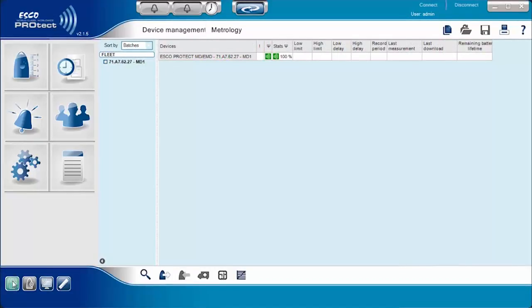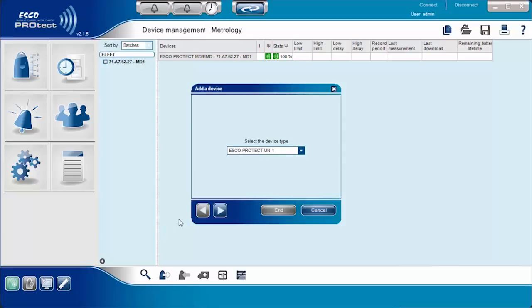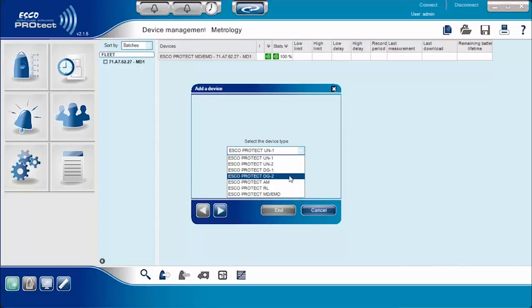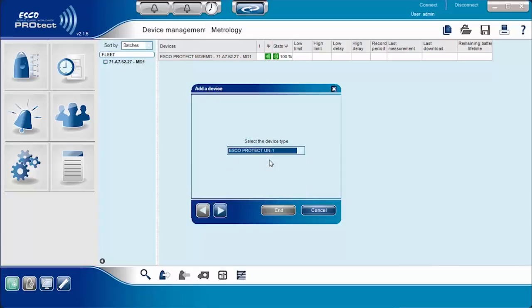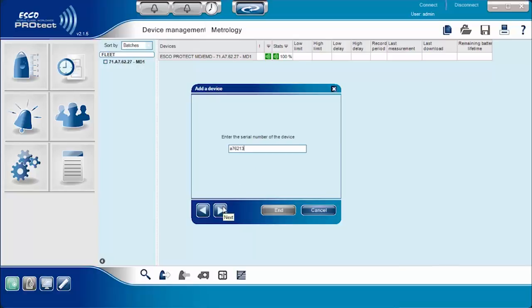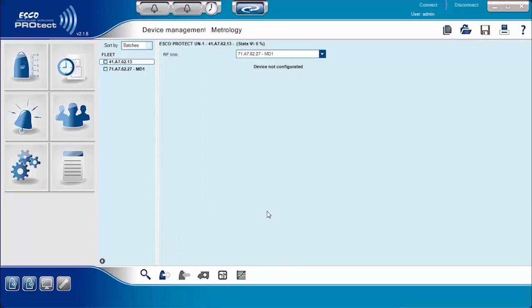The next screen shows how users can add different ProTech devices by selecting from the list of different ProTech devices. Click Next and enter the serial number of the device, which can be found on the device label.